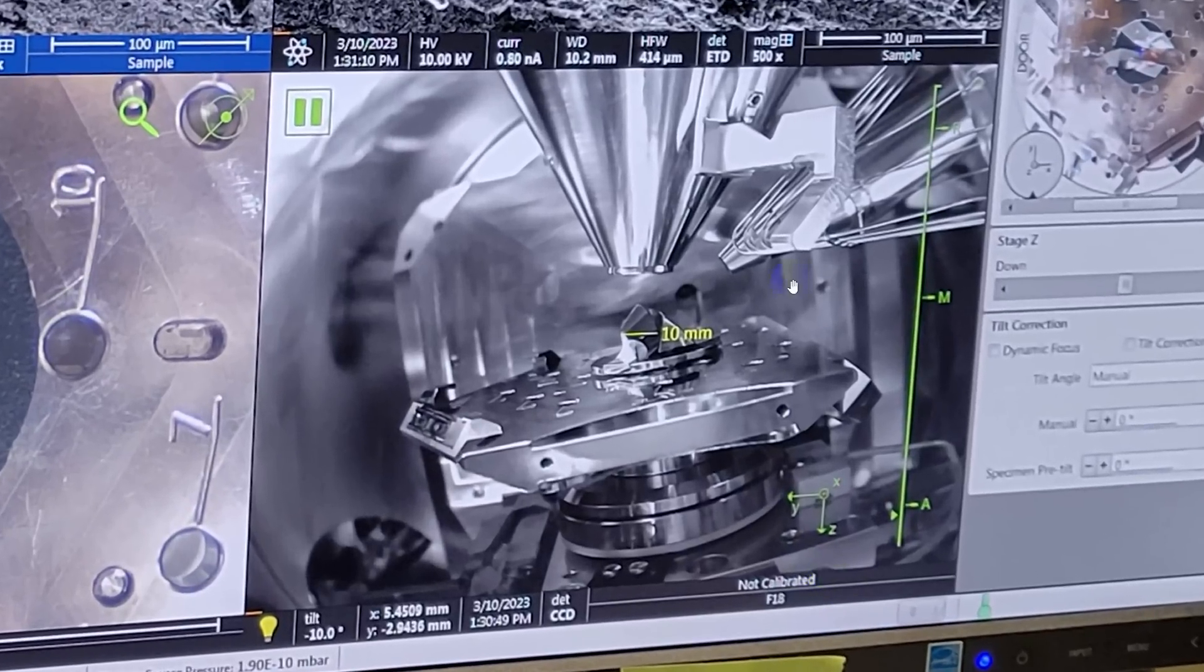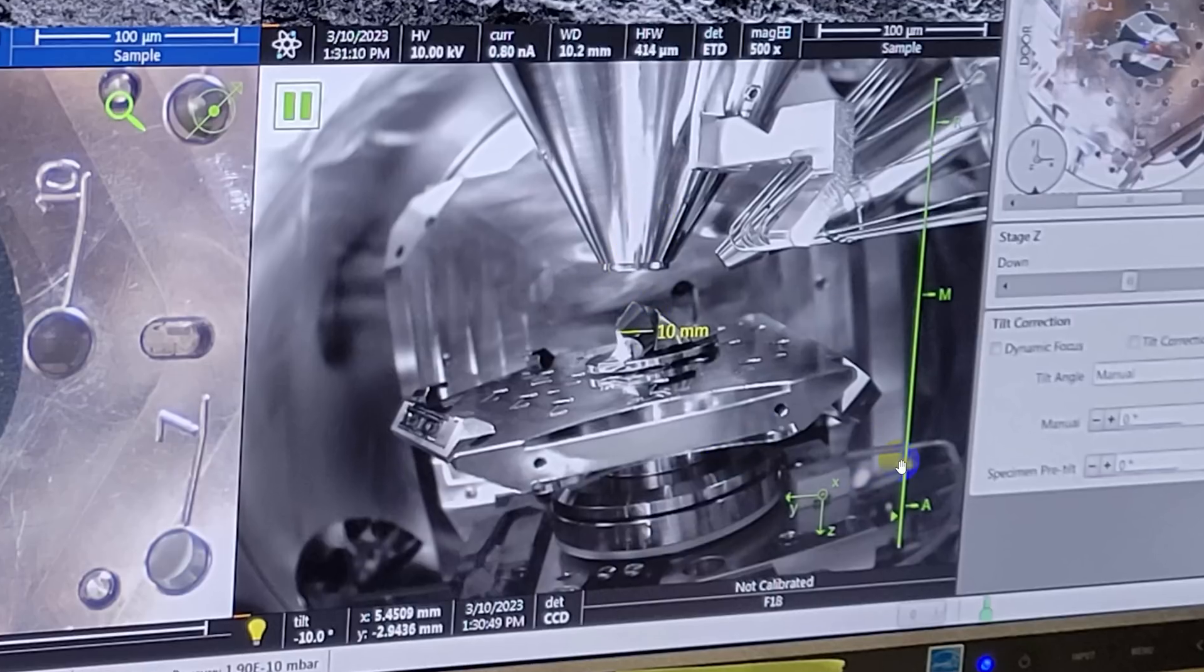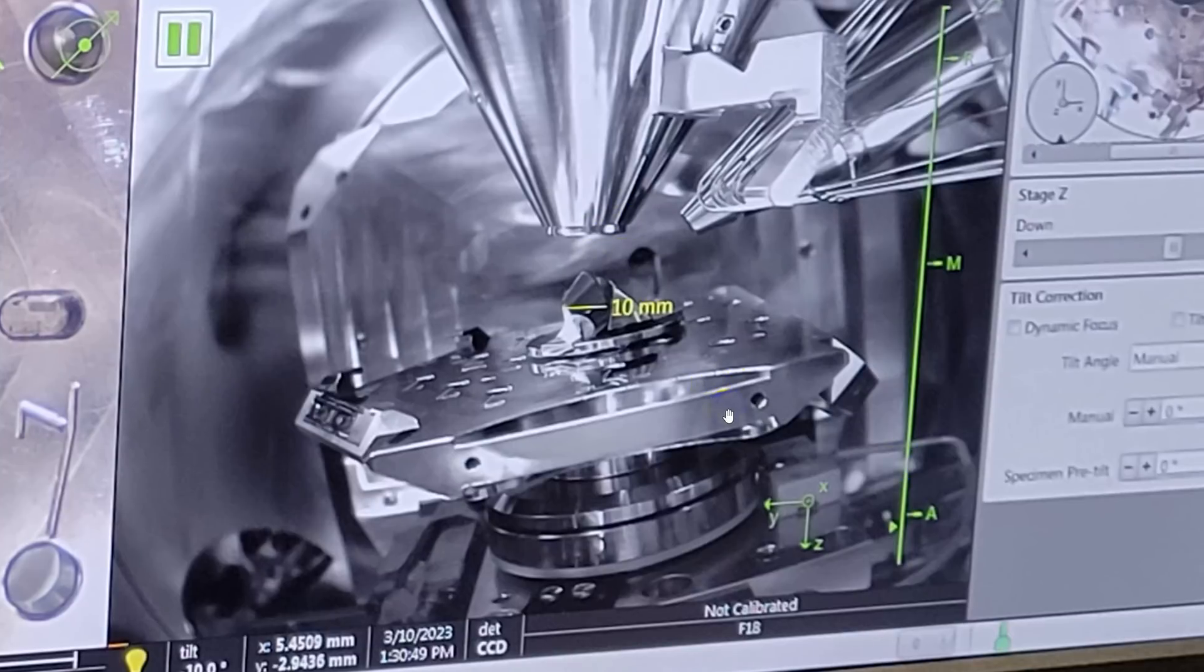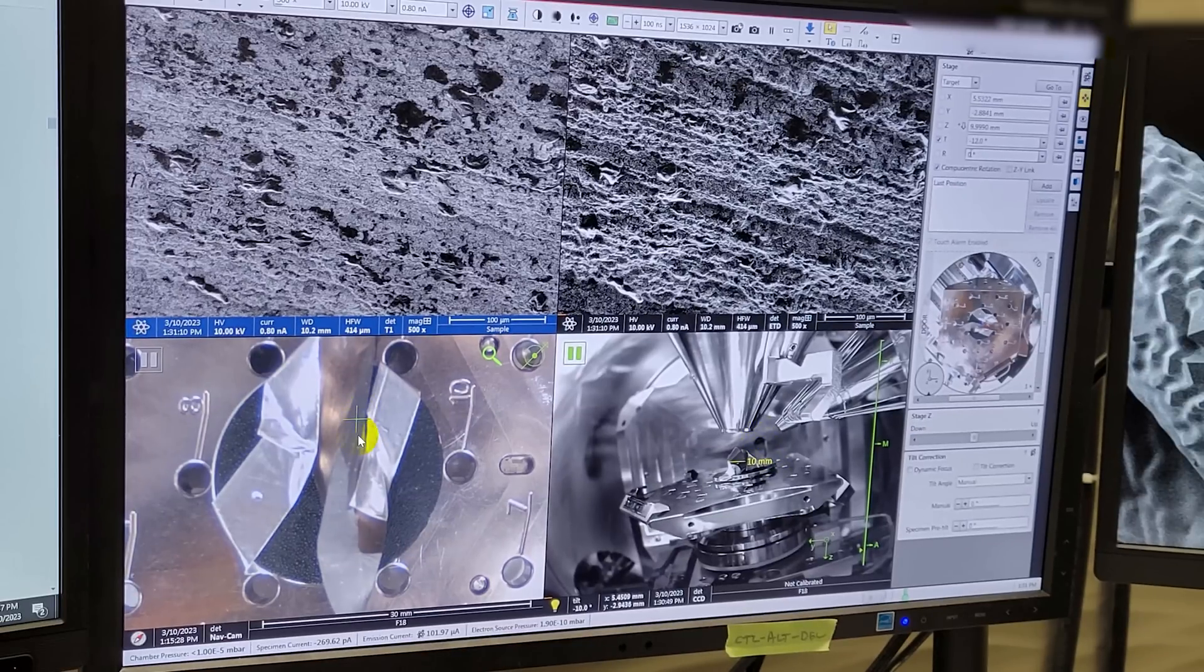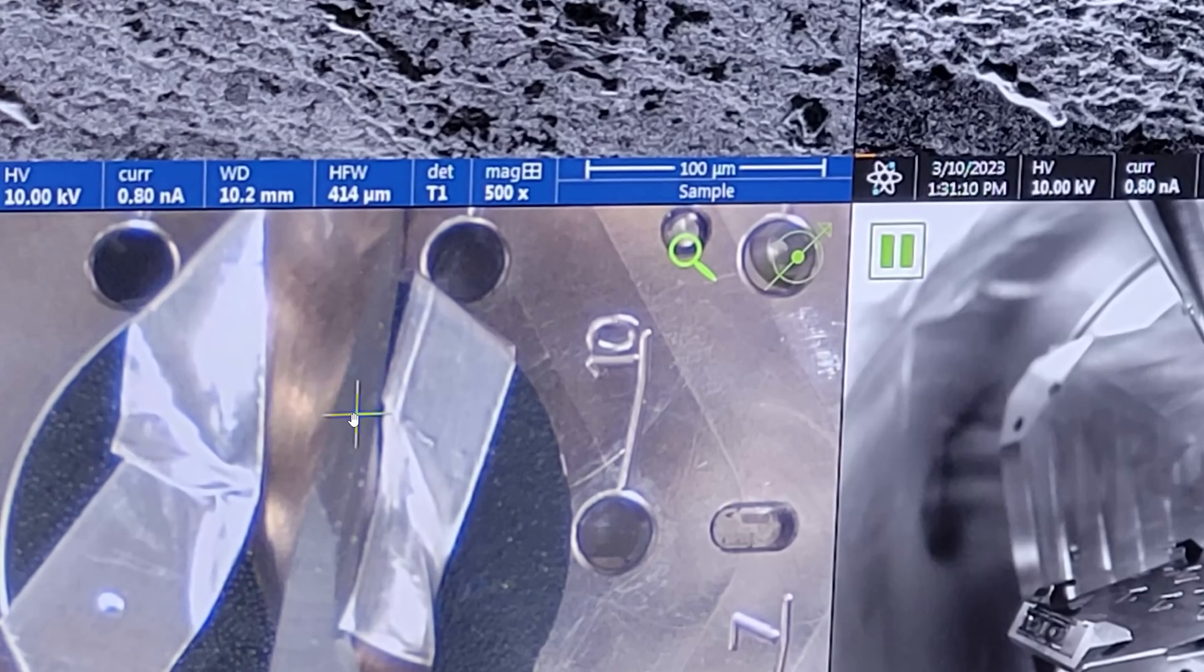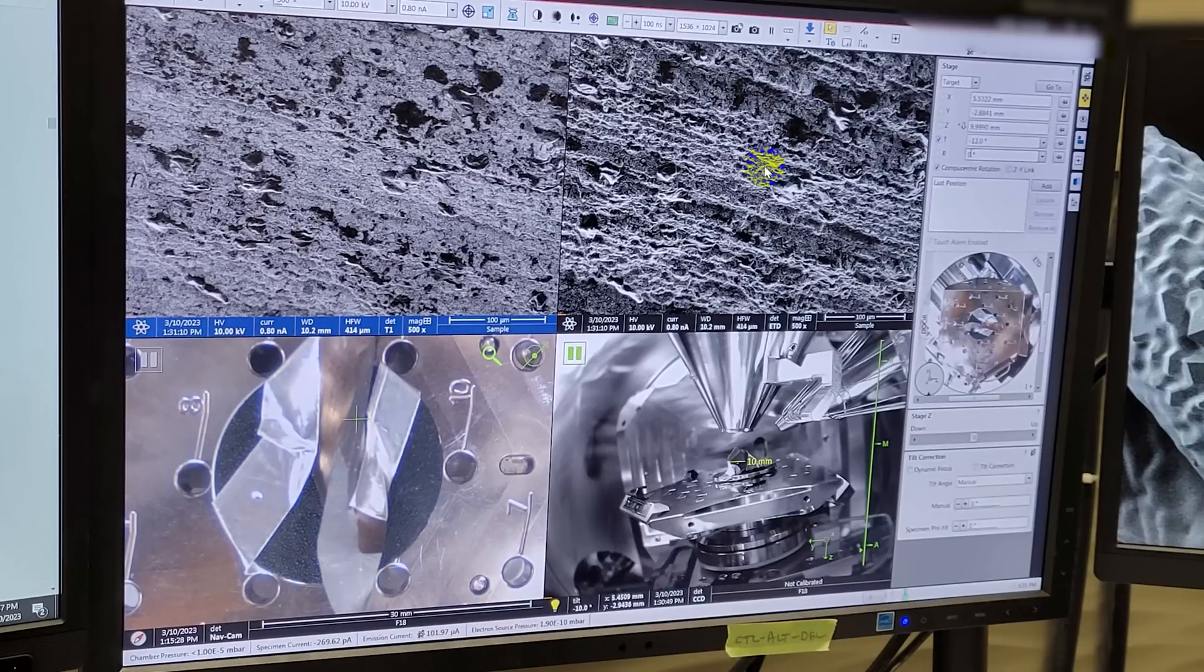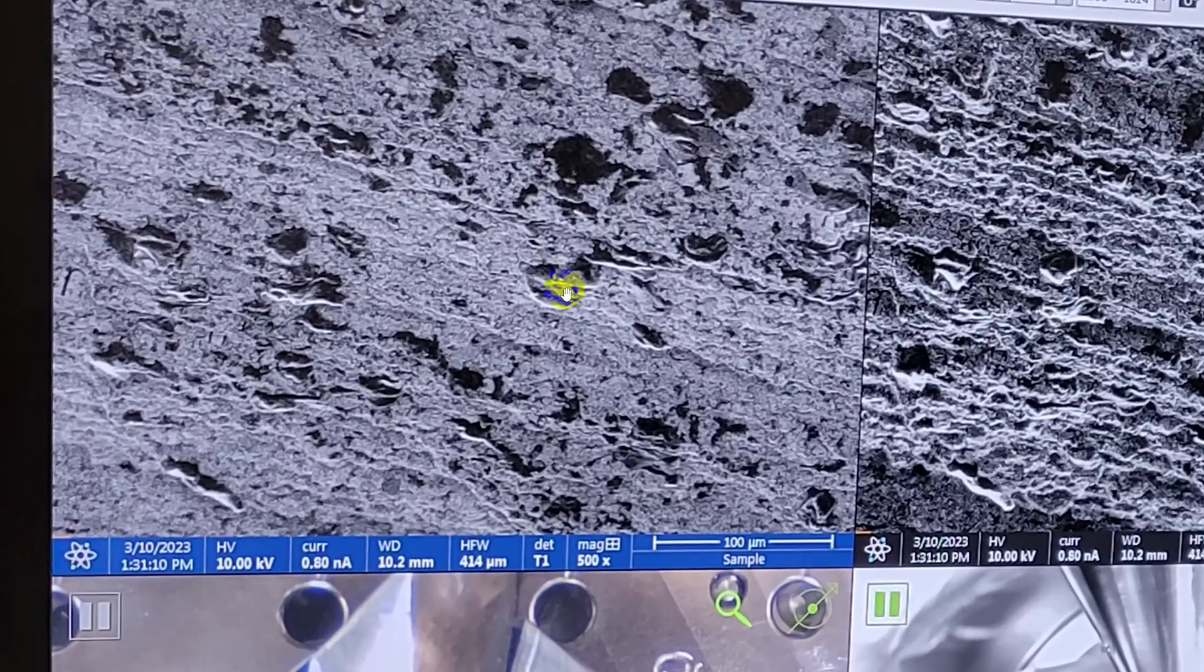With the sample loaded into the microscope and a vacuum drawn on the chamber, we have several views here. We have an optical camera inside that shows the sample sitting on the platform. You've got the main electron beam coming out here and you've got various detectors around the sides, including I think detectors in this tip. Don't quote me on this, I'm not an expert in this, but I do think it's pretty cool. Then over here on the left we have our targeting image that shows us where we're actually looking. In this case there's a green crosshair here, we're looking at this portion of the drill.